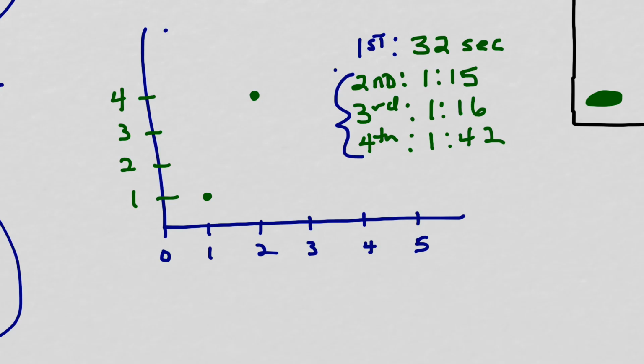So if you notice the first disk, I have a 1 here, within the first minute. So we'll say that each one of these is a range. From the 0 to the 1 minute, we had 1 disk rise. And maybe if I do this better, the real range would be between 0 to 59 seconds. Once it hits the 1, we'll say it's between the 1 and the 2. And this would be from 1 to 1:59. So that's probably the best way to do the range.